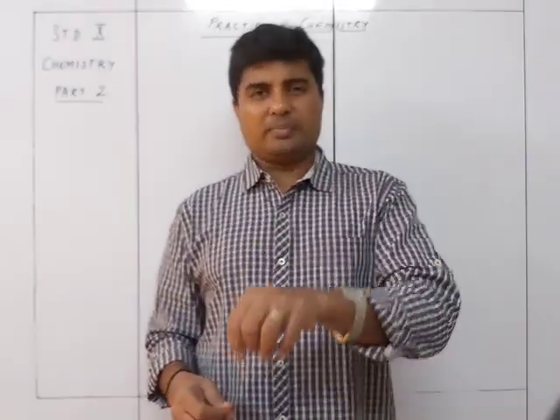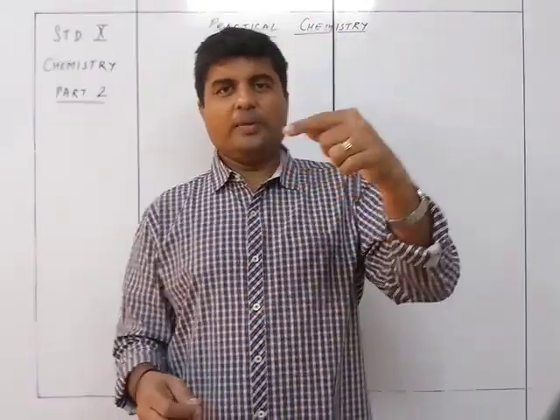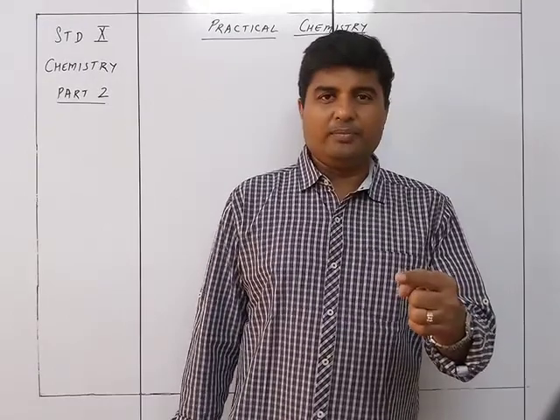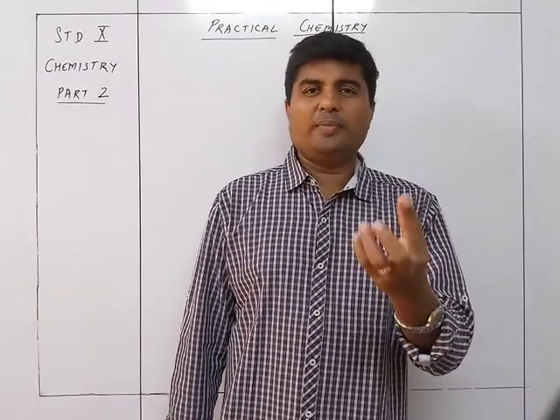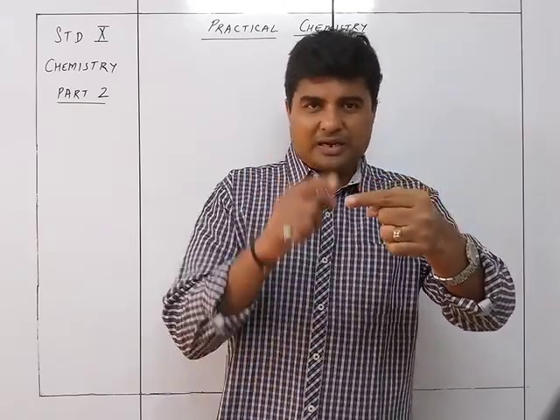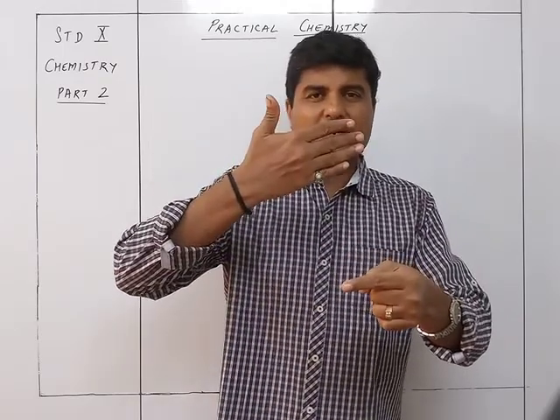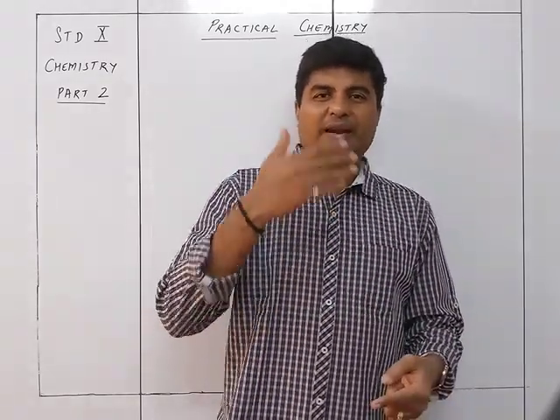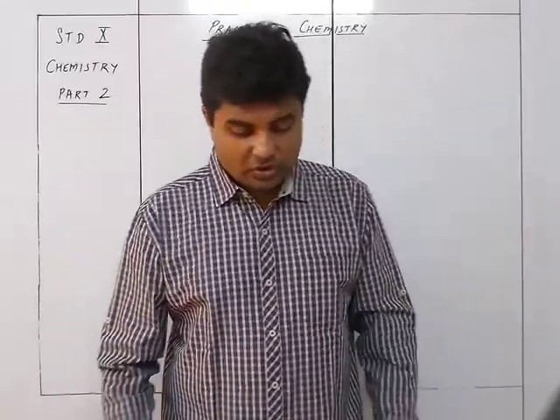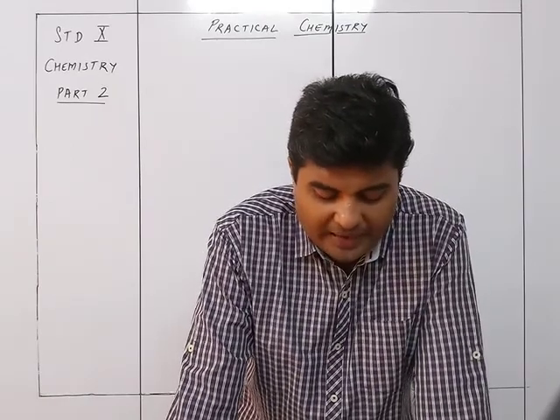So take sodium, potassium or calcium, dip the wire in it, and after dipping, put it into the flame again. The non-luminous flame is the blue colored burner flame. Now see the color change, and also see the color change through a blue colored glass. So you are going to take a blue colored glass and look. So the color imparted will be golden yellow, or pale green in blue glass.